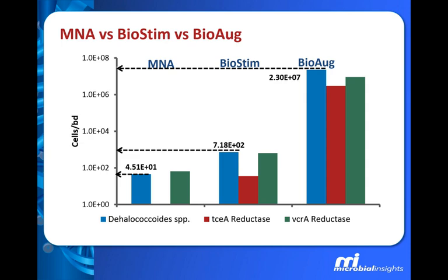Now if we go on and look at the bioaugmentation unit, as you might expect, you see a much higher concentration of Dehalococcoides in these bioaugmented in situ microcosms. And that's exactly what we'd expect if the bioaugmentation culture that we previously loaded into the beads is going to survive in that environment, and certainly it did.